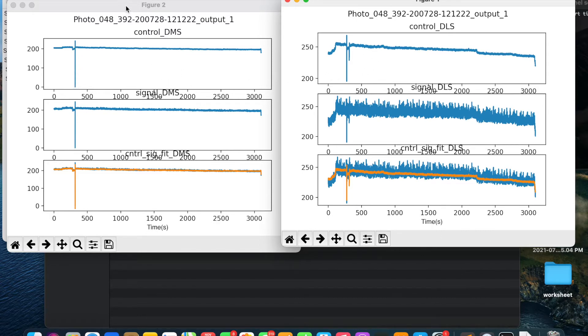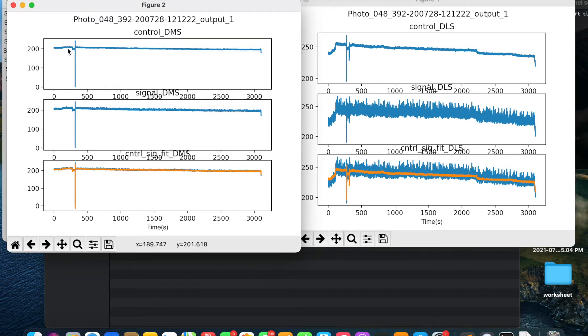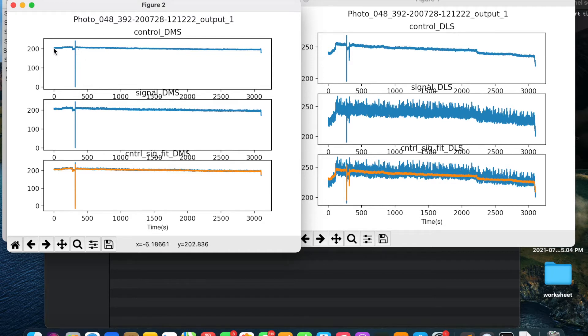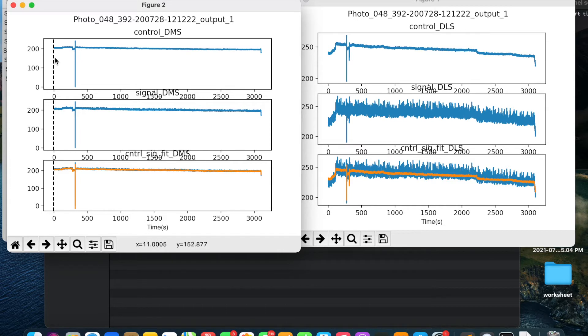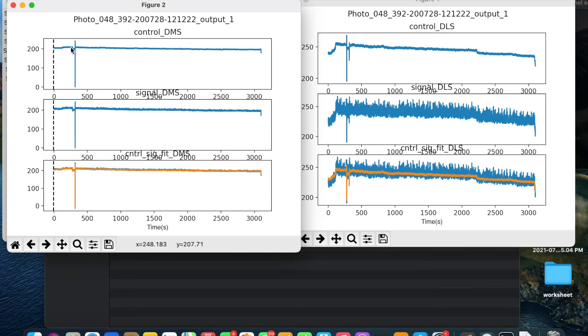We will select the chunks of data which looks good and which doesn't have artifacts. In this case, if you see from here to here it looks good and from here to here it looks good. I will put the cursor to the start of the chunk and hit spacebar on the keyboard. It will draw a line. This means that the start point of this chunk is selected. Now we will select the end point by moving the cursor over here and again hitting the spacebar.